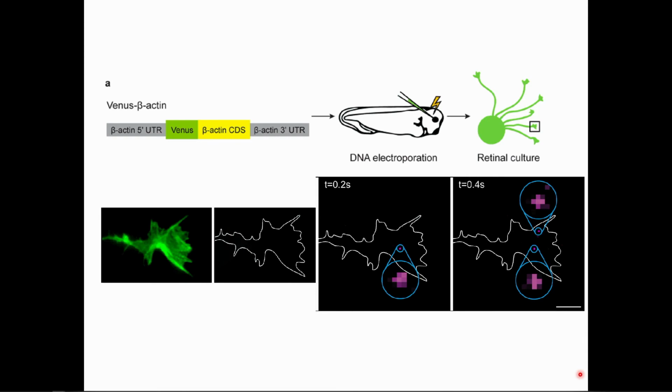So you do not actually have to switch the molecules off because there are only so few molecules there in the first place. And this is then the field of single molecule tracking, and that means you can use the same principle of fitting point spread functions in living cells, right? The only proviso is that you have a low enough density of fluorophores present.